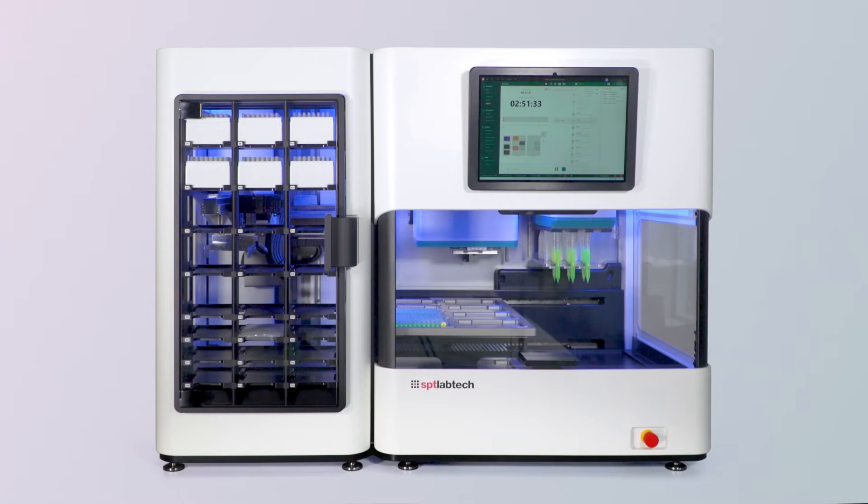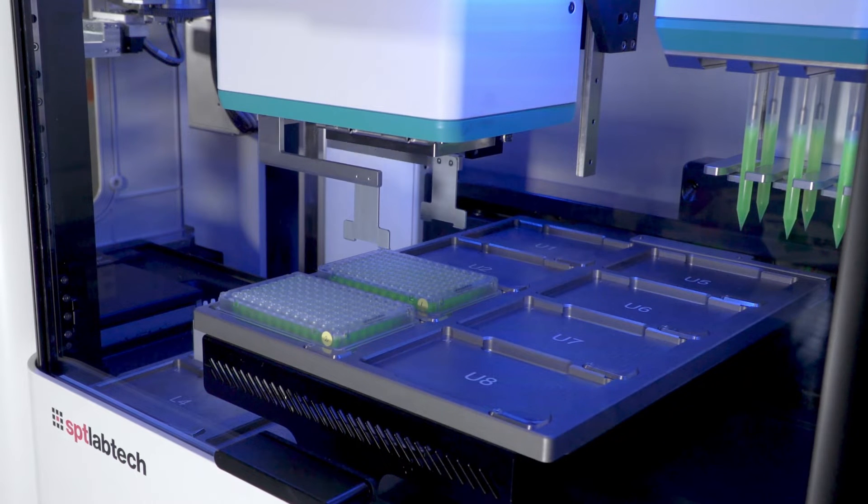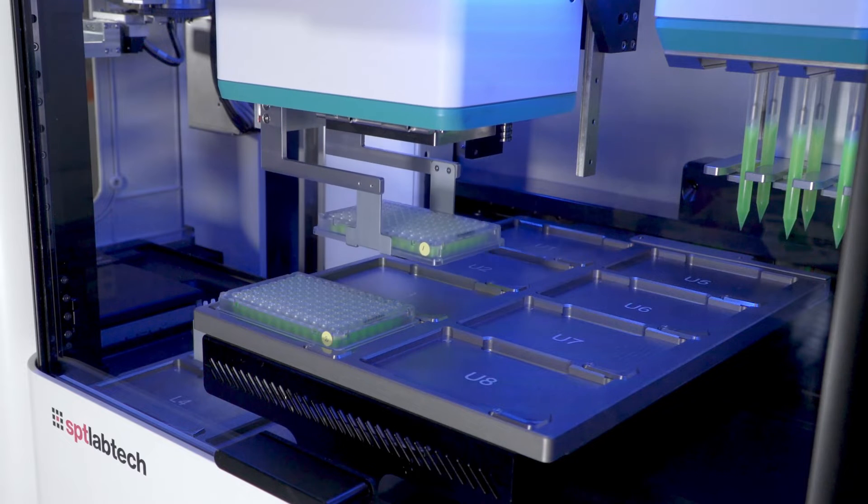You can see the plate has been placed on the upper deck of the Firefly. Next, the gripper from the Firefly will take over and move this plate — just brought from the PLUS — into a different deck position within the Firefly. This is done to optimize the dispense, which is the next step.